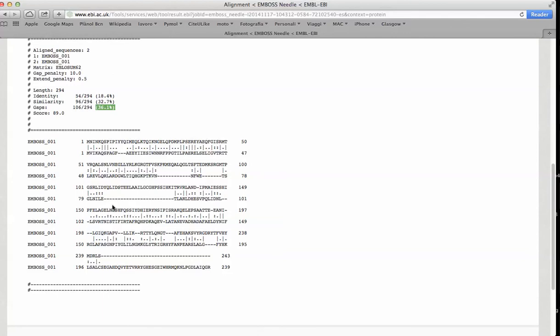So it seems that these sequences are separated by the middle, but some things have happened here. Let's go to try to clarify this.